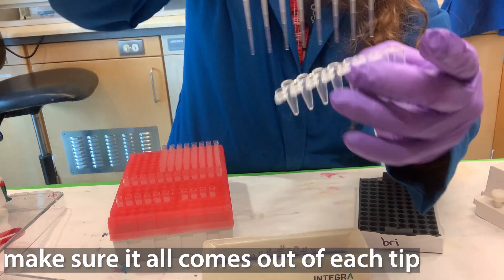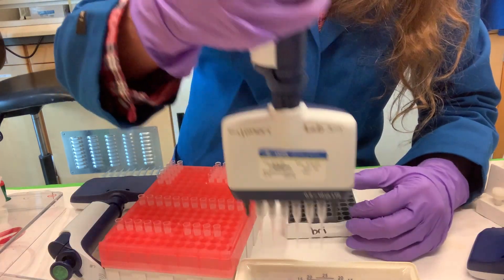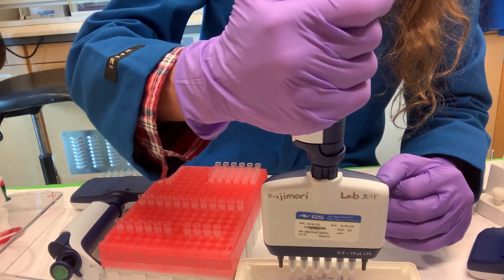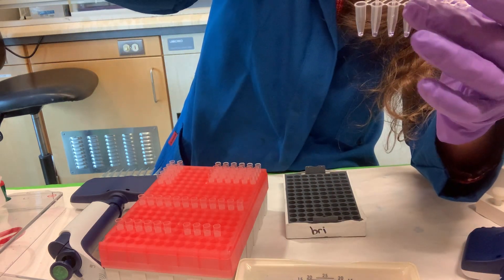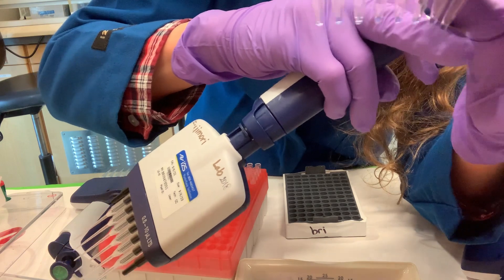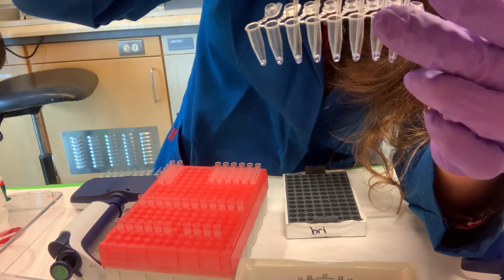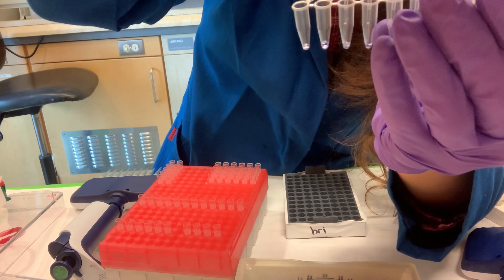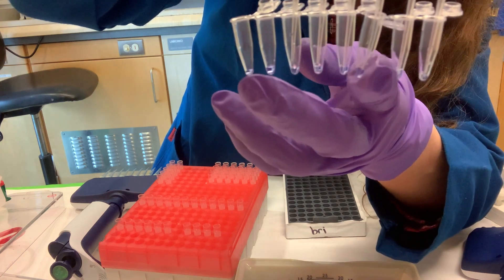When you dispense your sample, make sure it all gets out of every tip. Apply pressure vertically both when putting the tips on and when going into the liquid — stay straight above it. If you get a bubble at the bottom of the tube, which is really common especially during blowout, that can cause a problem when you go to pull liquid up. What you want to do is go below the bubble, pull up the air, and push the sample back to the surface. You may have to do it a couple of times to really get rid of that air bubble.